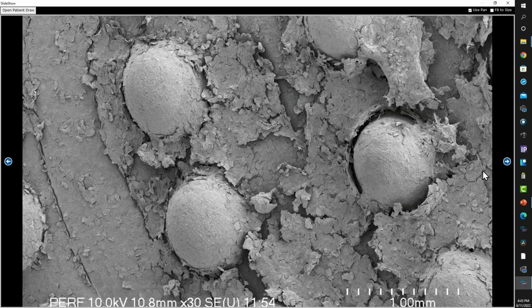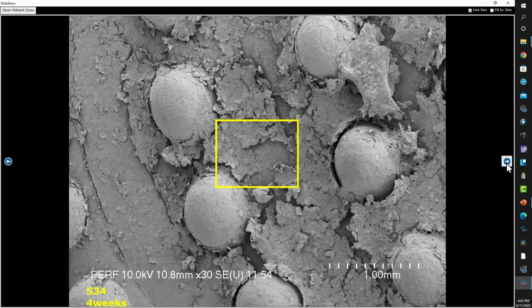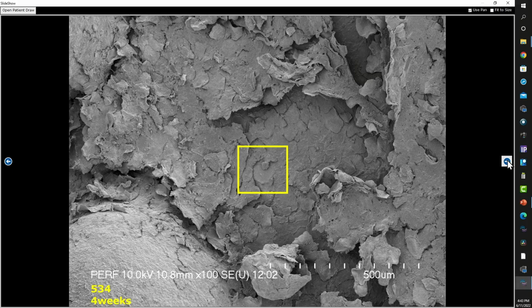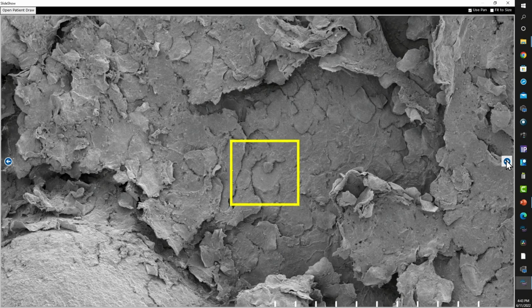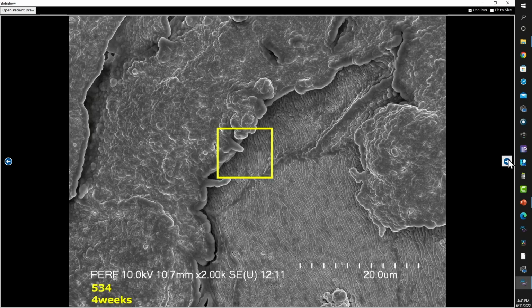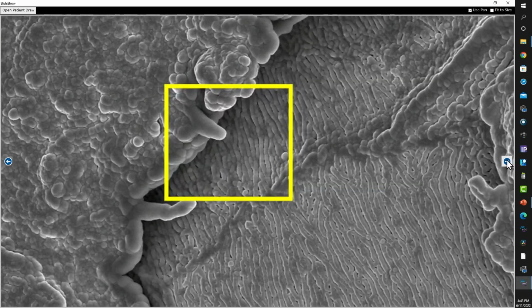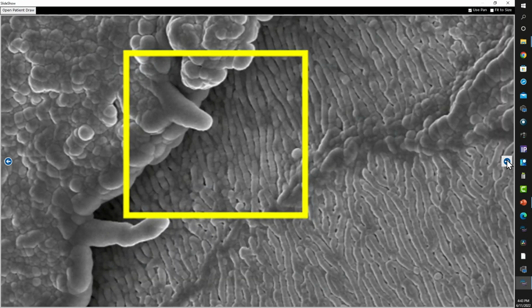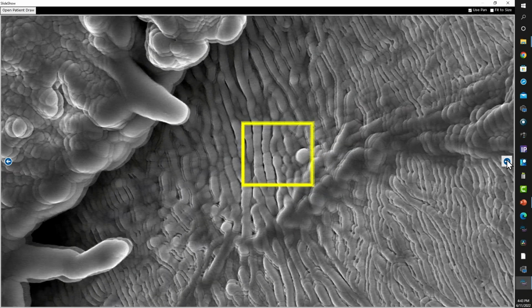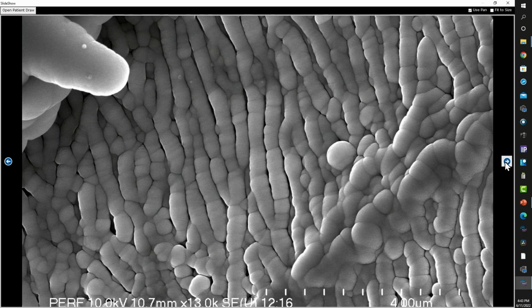So I thought this would be interesting for people to see what natural biofilms actually look like, and is helpful maybe later when we're trying to examine biofilms in endodontic cases that have had aged biofilms. Some of the pattern recognition here will help you recognize what biofilms likely look like. Here you can see there's not very much EPS, and you can actually see the individual organisms here. And it's easy to tell that these are bacteria now.